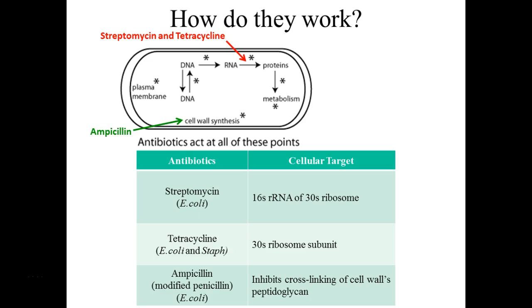We didn't bother testing it against staph because, did you guys notice how huge the penicillin zone of inhibition was? Like that plate, I could only put one other antibiotic on it because otherwise the zones just run into each other and you can't measure it. This zone would be huge too because it's basically penicillin. So it acts the same. It's very damaging to gram-positives. So we didn't bother doing a plate for that one. But we wanted to show definitely the effect that this modified penicillin has on E. coli, that this modified penicillin can affect gram-negatives like E. coli.